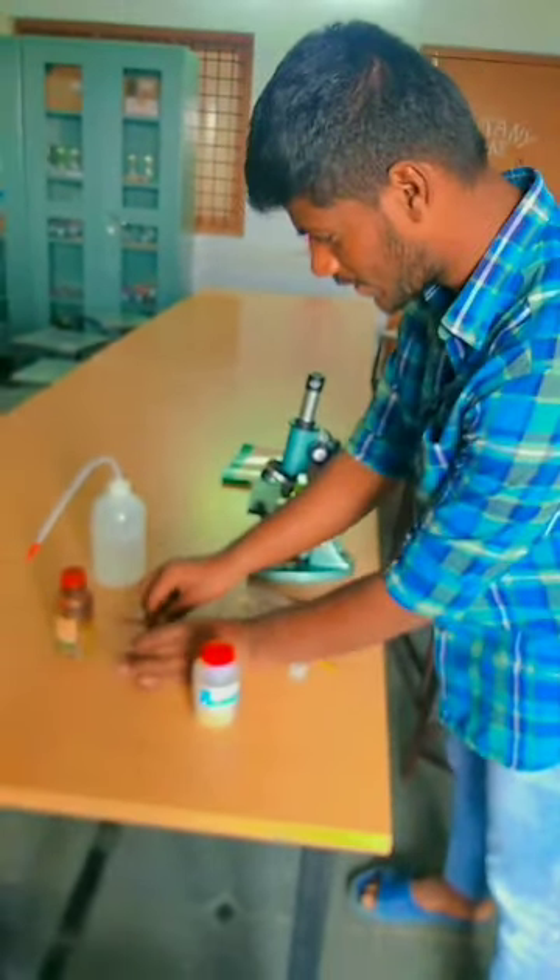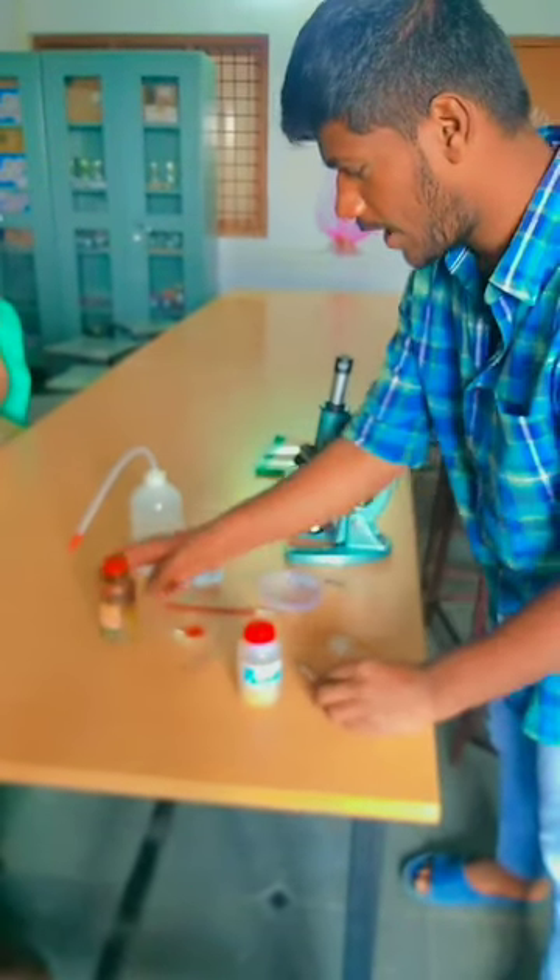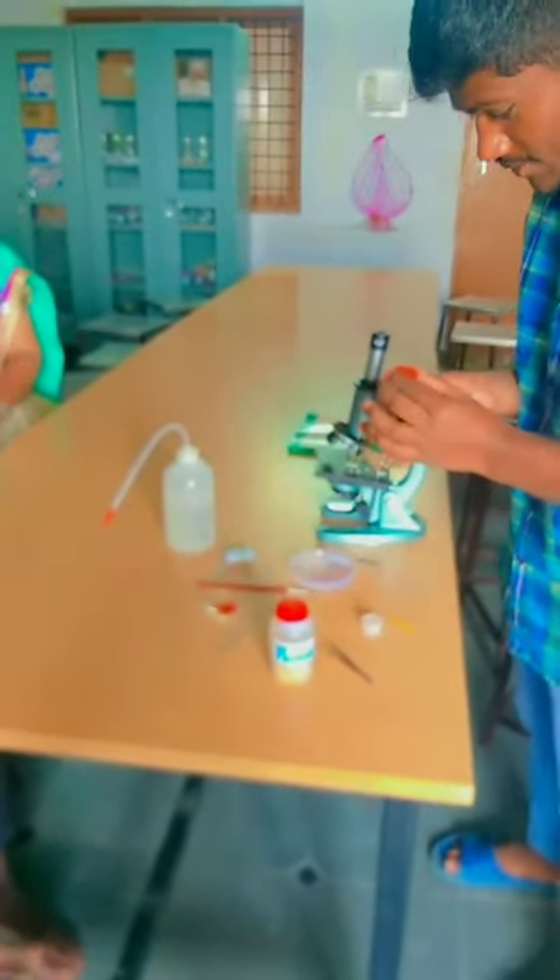Then we want to put the slice in a glass and add one drop of methyl orange for staining. Take the slice deep into the stain.